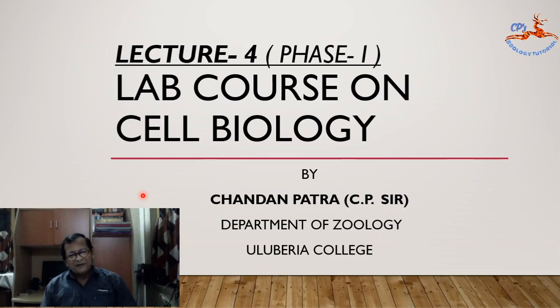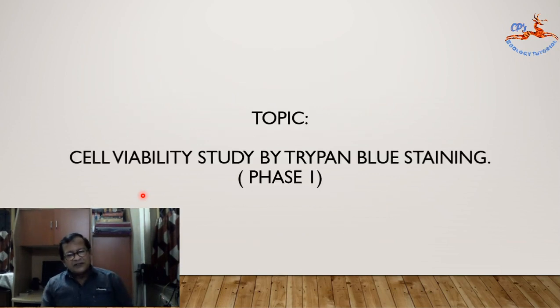Hello students, I am going to take your zoology practical class on cell biology in an easy way. My topic today is the cell viability study by Trypan Blue staining. I will discuss it in two phases.